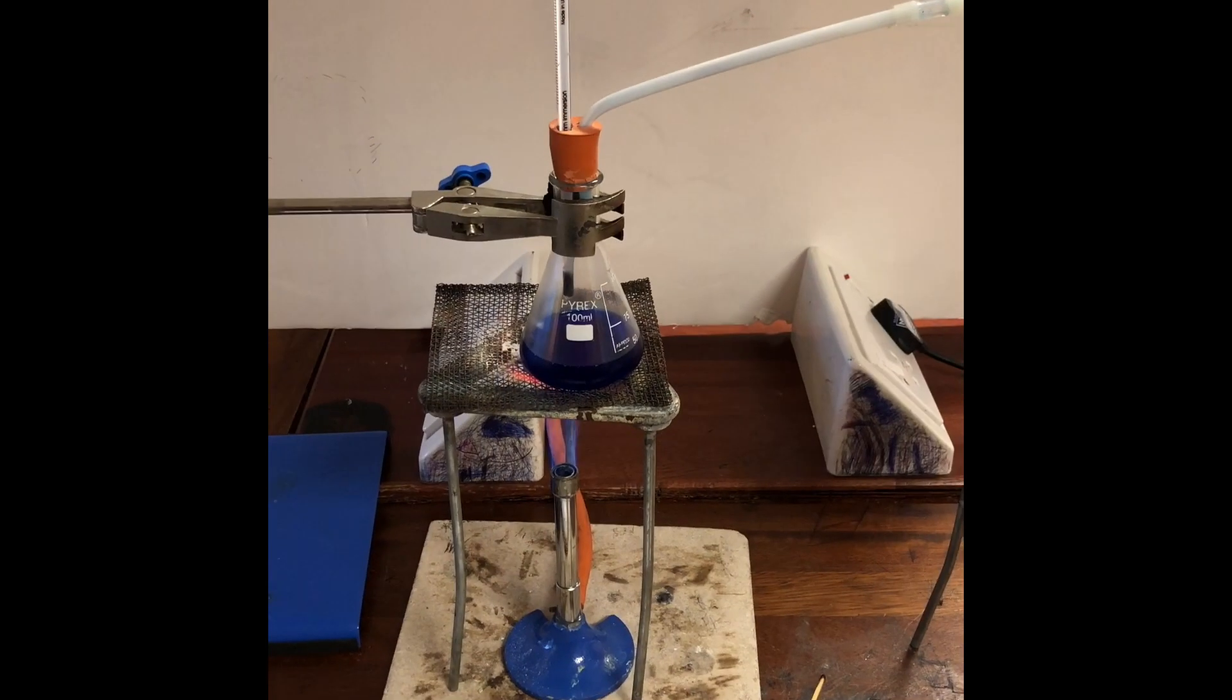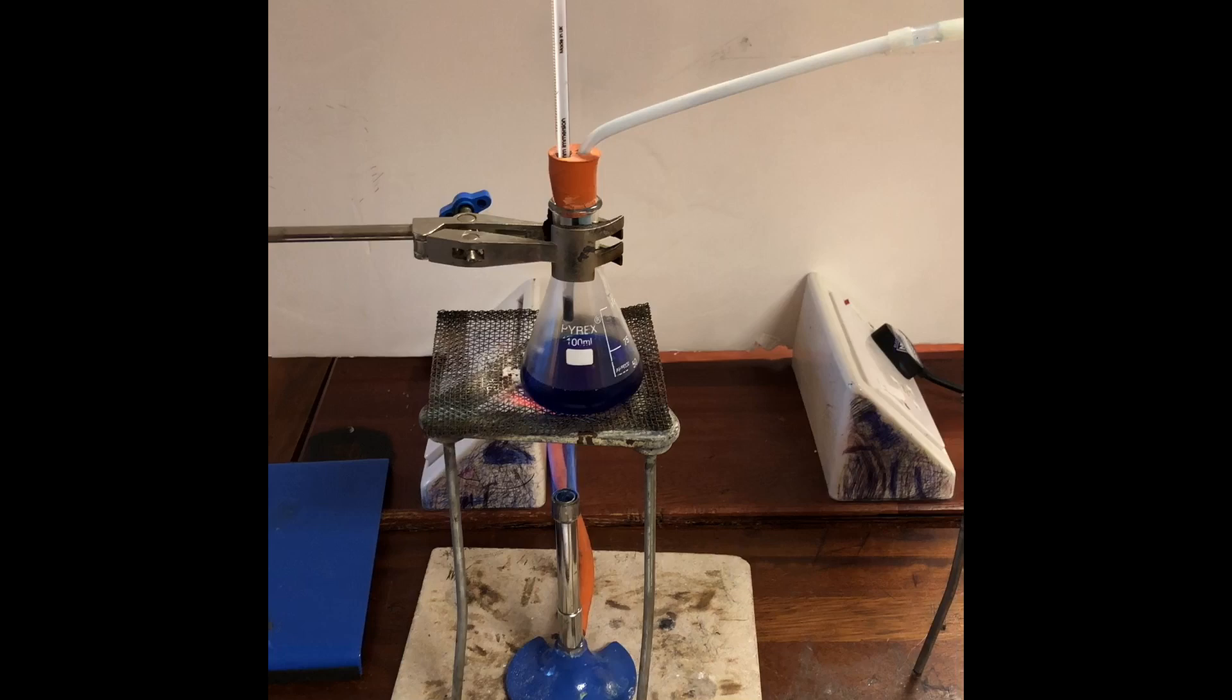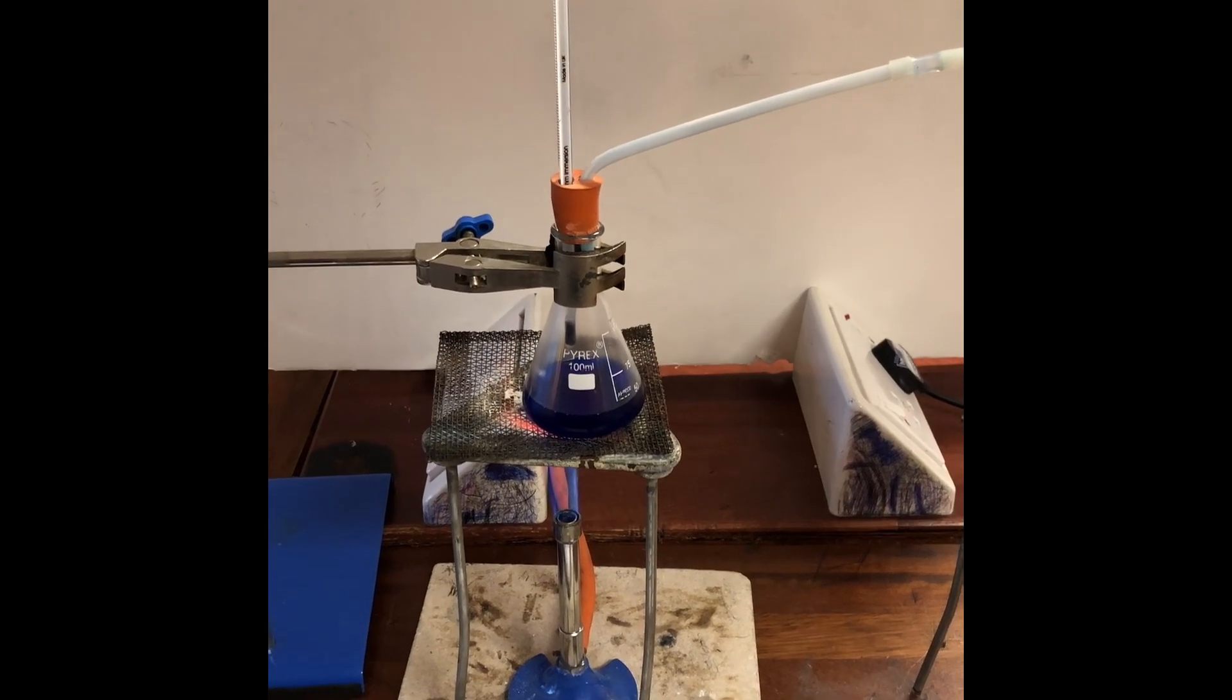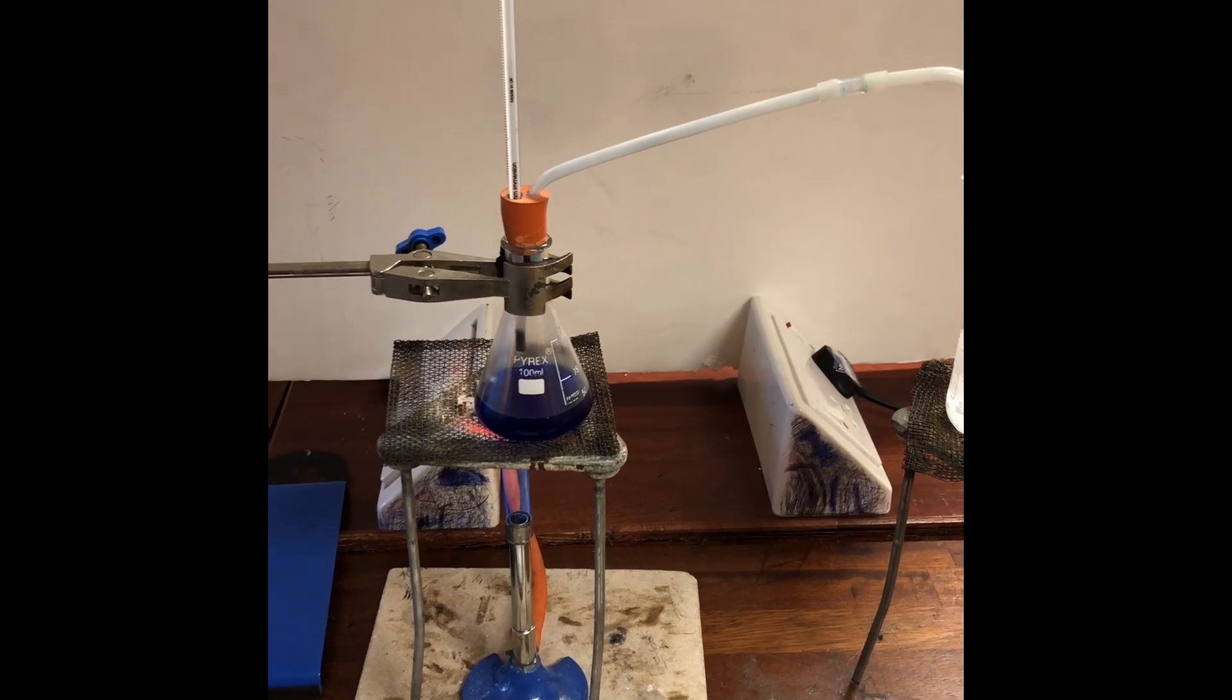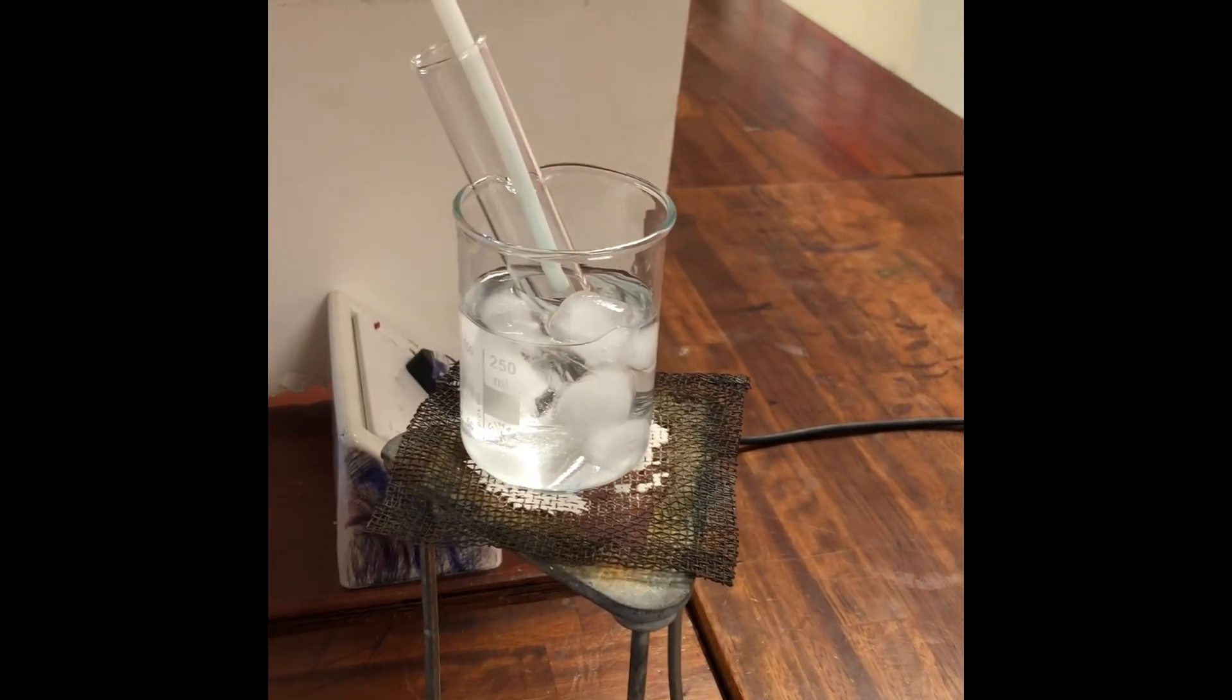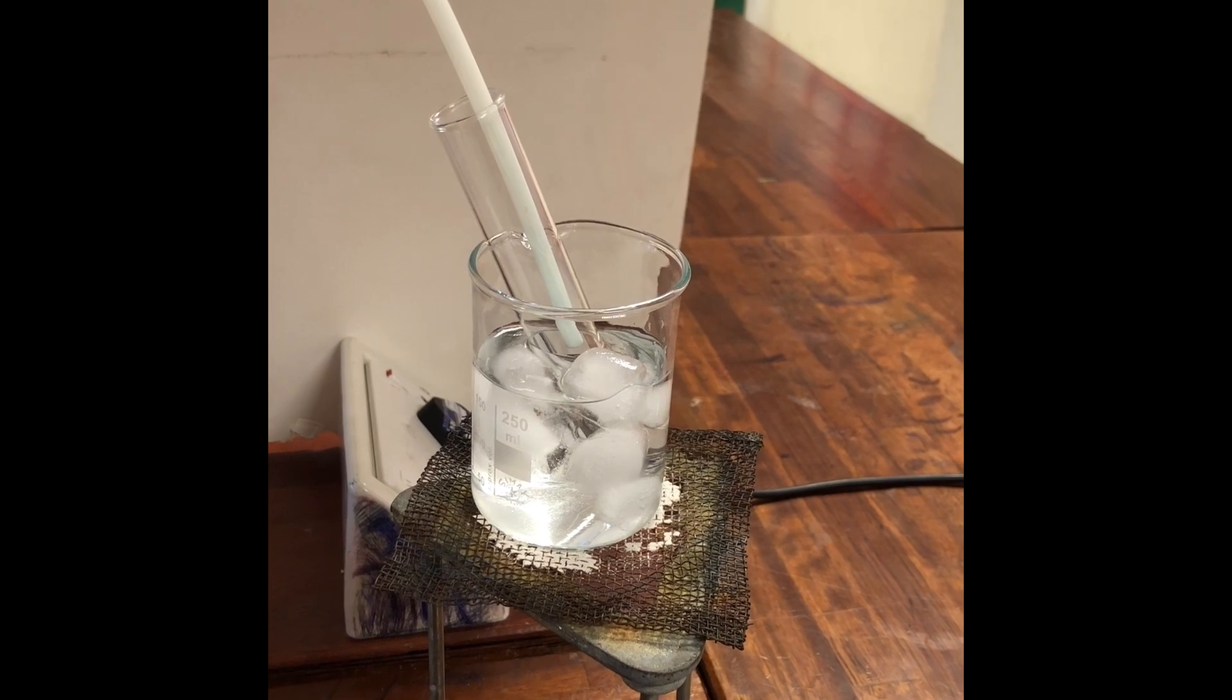So I've set the experiment up. You can see I've got a blue flame on my Bunsen burner, and the purpose of that is we don't want it to boil too quickly, otherwise the ink and the water will come through. And we're just going to leave that and watch this iced water to see what happens.